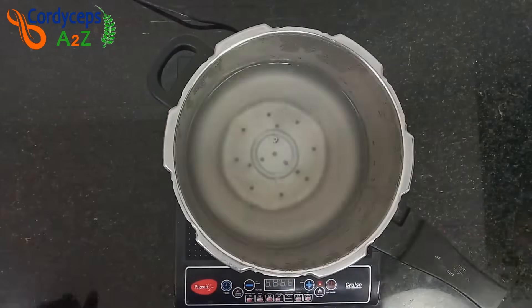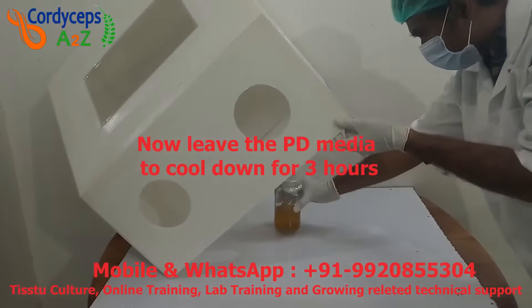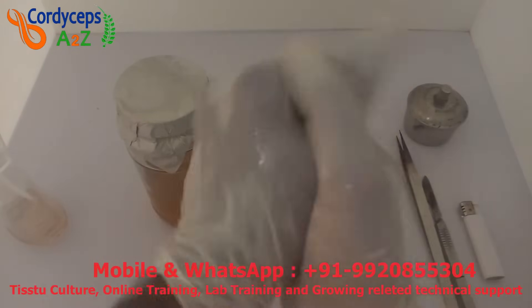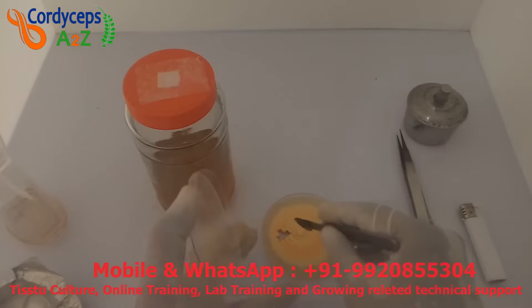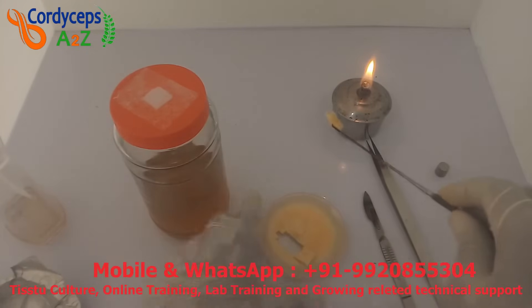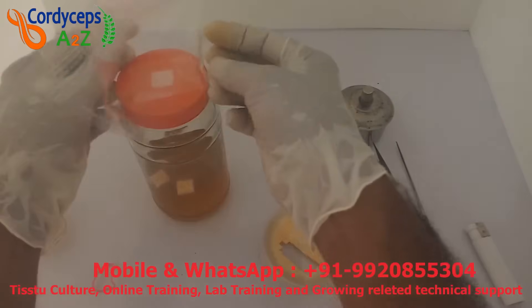Sterilize this bottle using the same previous process. After 50 minutes of PD sterilization, keep it in the inoculation box to cool down for 3 hours. After 3 hours, inoculate the tissue culture into the PD. Before inoculating, clean hands with isopropyl and heat all equipment on the spirit lamp. Remove the aluminum foil from the bottle, then take the surgical knife and cut two pieces of approximately one square centimeter from the petri dish and put them in the bottle. Close the cap tight and put a PP bag on top of the cap.